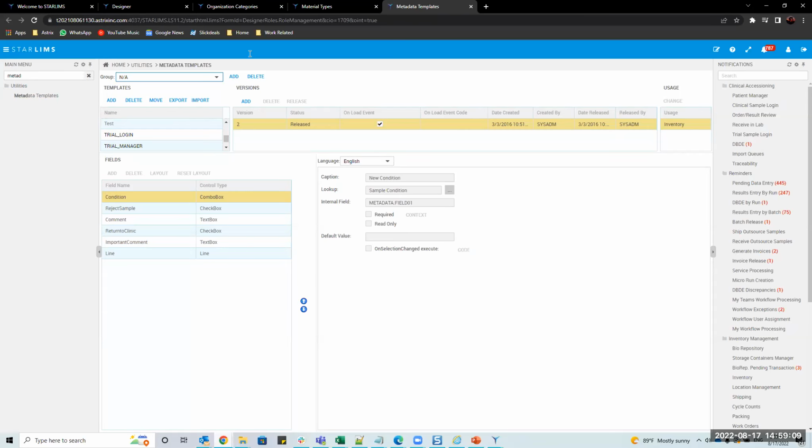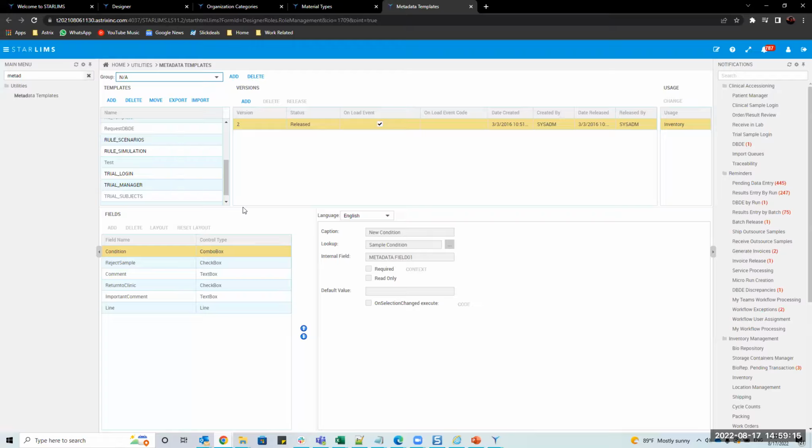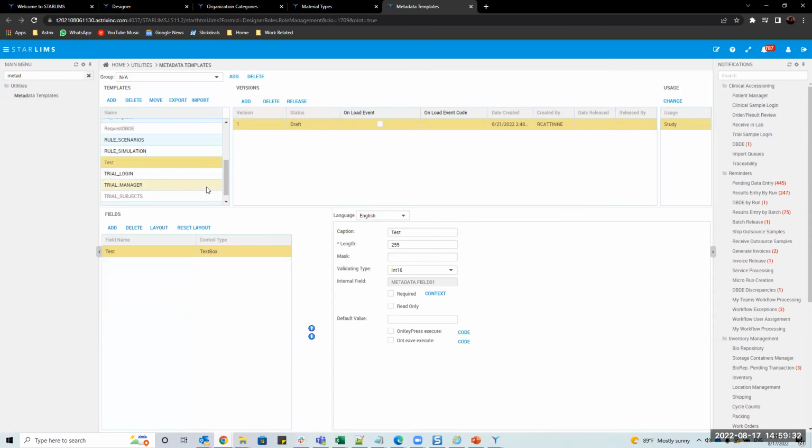The remaining 5%, like this app here, did not get converted. By the way, here's a splitter. So many splitters, right? You have a horizontal splitter splitting up this top part and this bottom part. And then you have another vertical splitter here, splitting this one and this one. I think I got those wrong, right? Vertical V and then horizontal, yeah. So let me show you here. So this layout, if I click here, you see it kind of thinks and then nothing's happening.